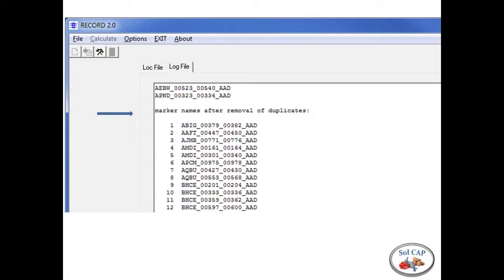So it doesn't map all your markers at once in the initial steps, just to save time. And this is really important once you get to really high density maps. I'll give you an example. In Pepper we map 16,000 unigenes, but we only have 2,800 unique haplotypes, or 2,800 genetic bins in that map. So it's a much easier task to map 2,800 than 16,000, of course. And then you reassociate after the fact the haplotypes that are the same.